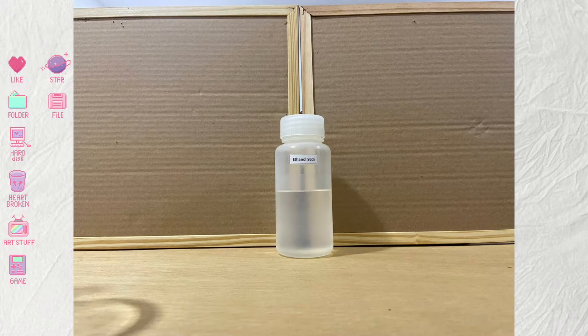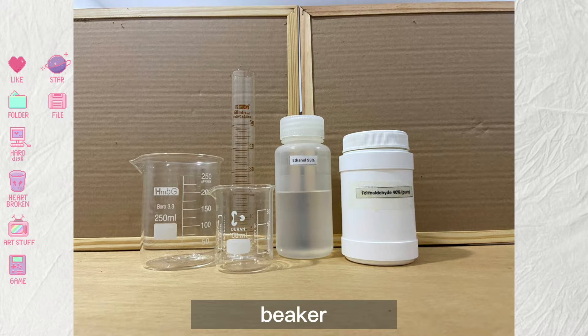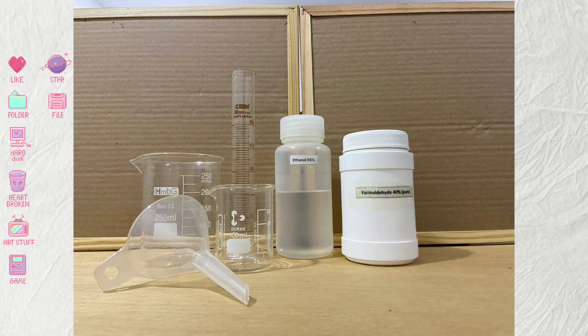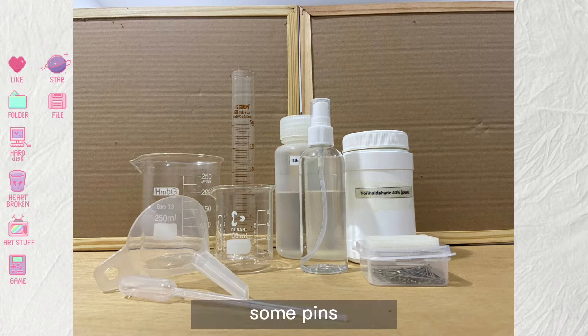You will need ethanol, formaldehyde, measuring cylinder, beaker, filter funnel, pipette, and water spray.